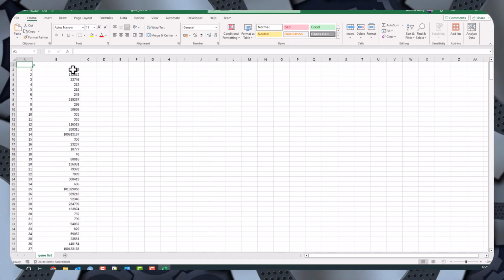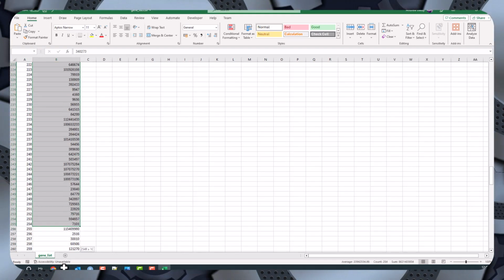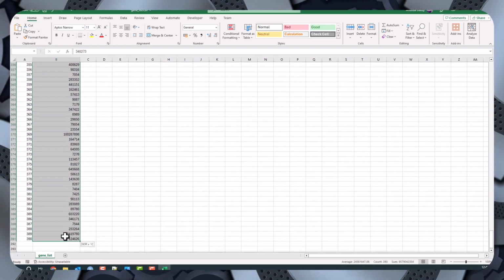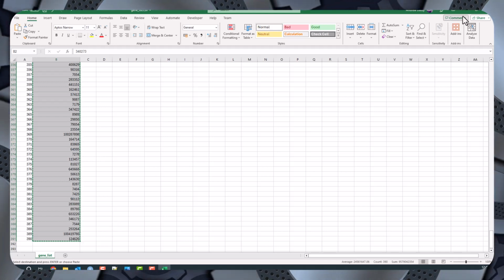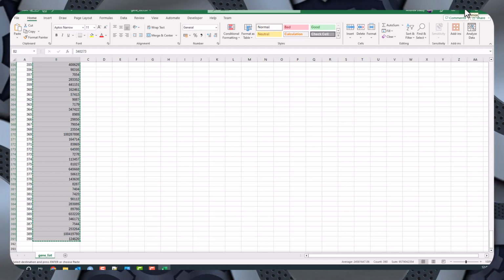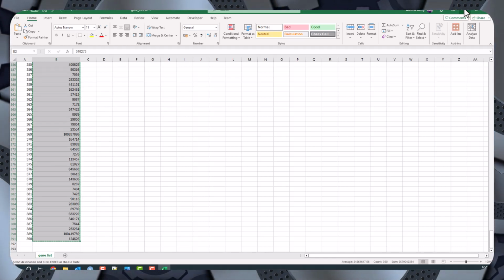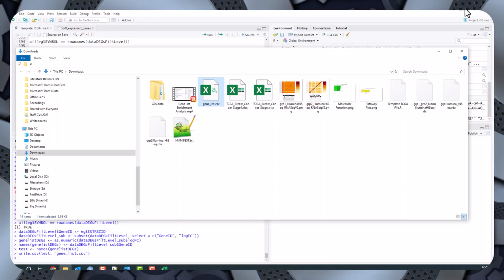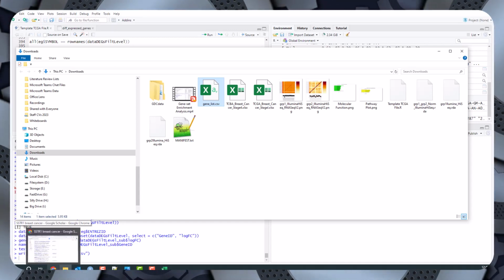So the Entrez IDs are numerical. Now, only 390 of them have been identified within the Entrez IDs from the Ensembl IDs. That happens because different databases have different definitions about what sort of data they're going to have in them. So for example, this might not include any of the non-coding RNAs, which I don't want for this particular pathway analysis anyway.